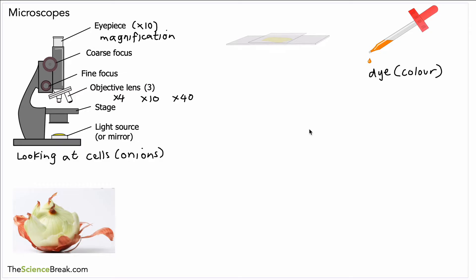So what would be useful is to have a set of steps for how to set up a sample of something like onion skin in order to see the cells. The first step would be to prepare your slide as we've just shown. Then we would need to place the slide onto the stage of the microscope very carefully.